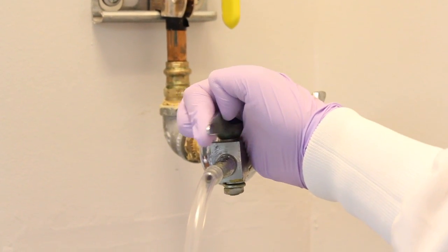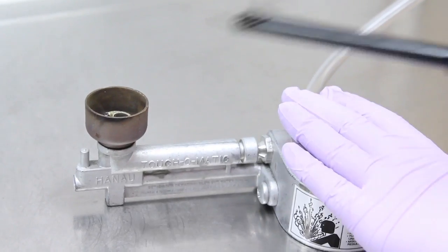Light the Bunsen burner for the flame sterilization of your tweezers. The gas valves are located in the corner of the room.